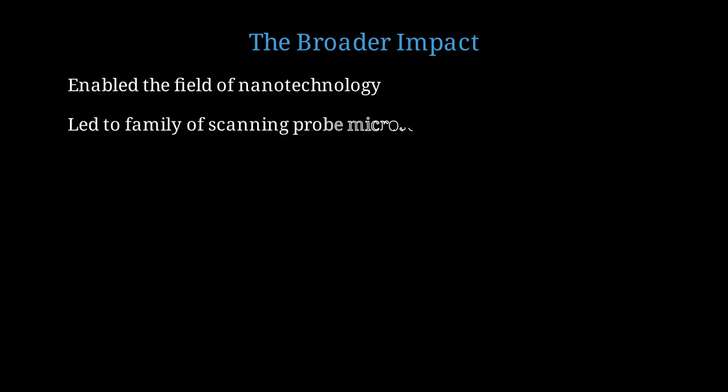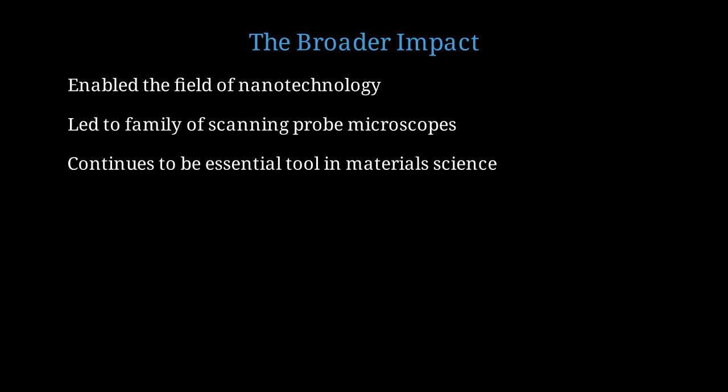The success of the STM inspired a whole family of scanning probe microscopes, including atomic force microscopy, magnetic force microscopy, and many others, each probing different physical properties. Today, the STM remains an essential tool in condensed matter physics, materials science, and surface chemistry. New discoveries continue to be made with ever more sophisticated STM techniques.